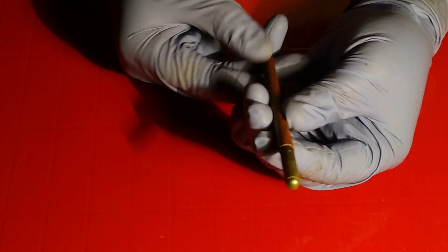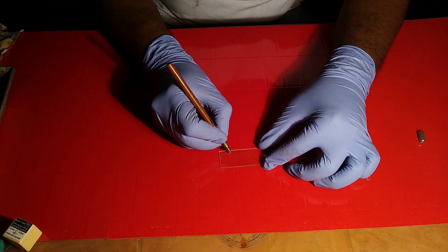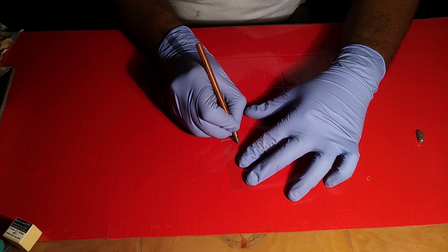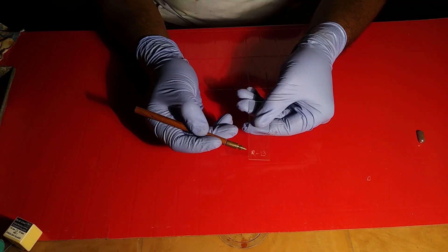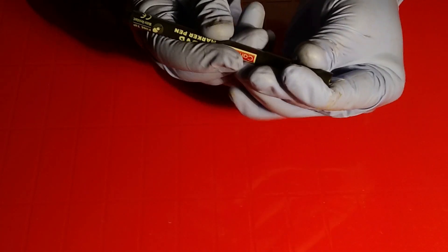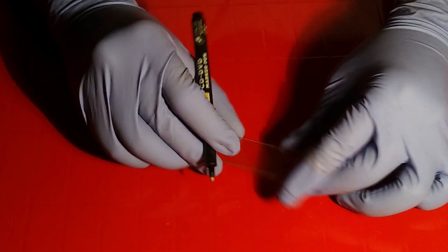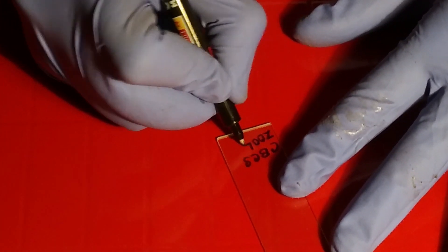Next, and most importantly, is the slide marker. During practicals, examiners write roll numbers of students on slides. Students, during practice sessions, also need to mark slides — for example, writing 'R13'. A permanent marker is also used in many cases, but during staining sections we usually avoid it. For temporary purposes, you may use this kind of slide marker.